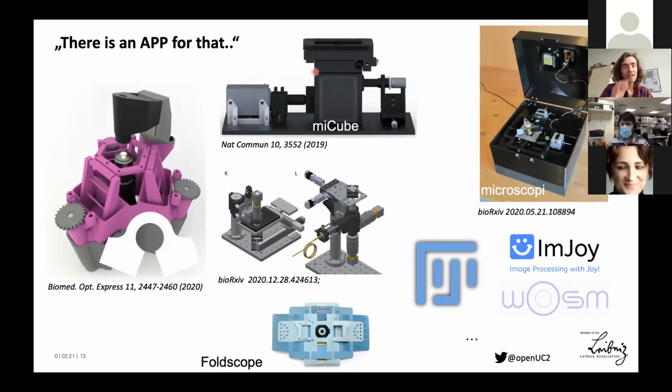So all of these things serve you open source hardware and software to really fund your research easily. So you never need to start from scratch. You can always build on top of something.